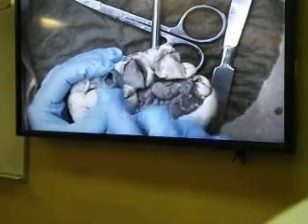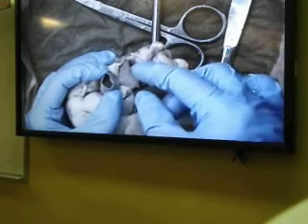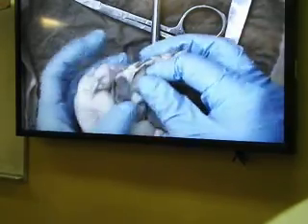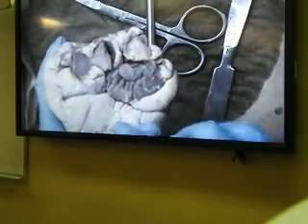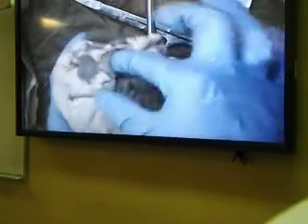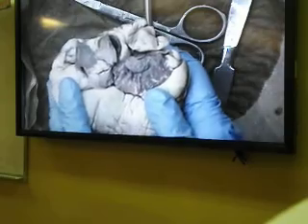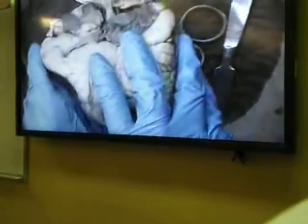This blood vessel we call the brachiocephalic artery, and it gives oxygenated blood to the right side of our head, and it is a very important artery. However, for now all you need to know is the aorta. Still, in most of your hearts you may be able to see the brachiocephalic artery. Alright, so once you see the pulmonary trunk and aorta from the anterior view, it's time to go to the posterior.